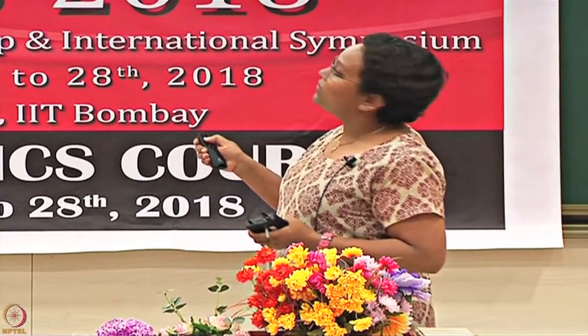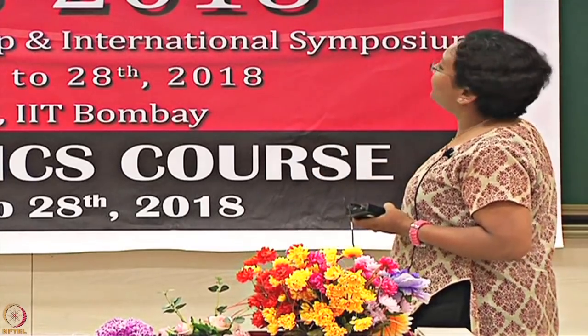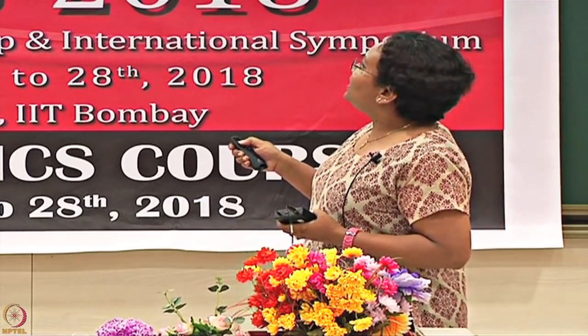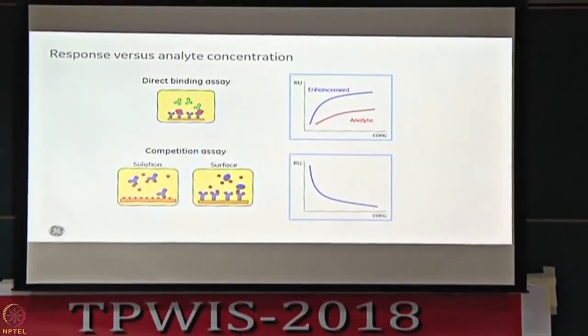You mix them. In the earlier case the binding was happening in solution, but here there is no binding in solution. When you put this mixture on your surface where your ligands are bound, you see the binding only because of your competing analyte. When these analytes are small and negligible, you do not get to see your binding. So, here too, with increasing concentrations of your analyte, you see less and less binding. So, it is again a reverse plot, right.